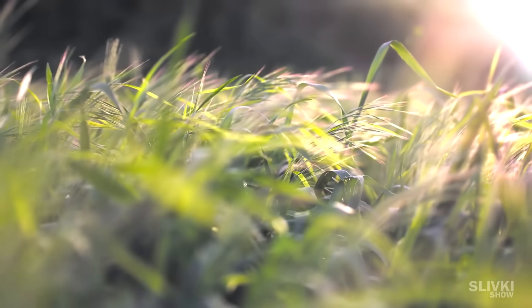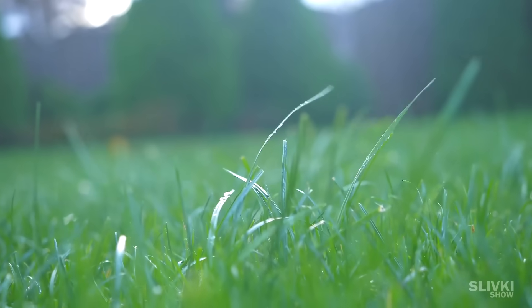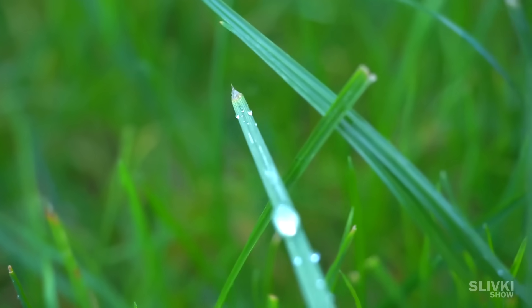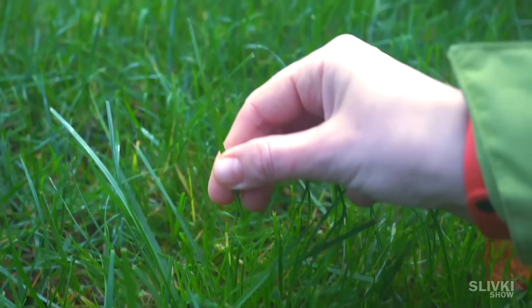We usually think grass is a pleasant and harmless plant, but it often happened when I was a kid that I would cut my hands on wheat by picking it. We put it under the microscope — at first glance there is nothing supernatural. We see the structure of the grass and even some kind of cells.